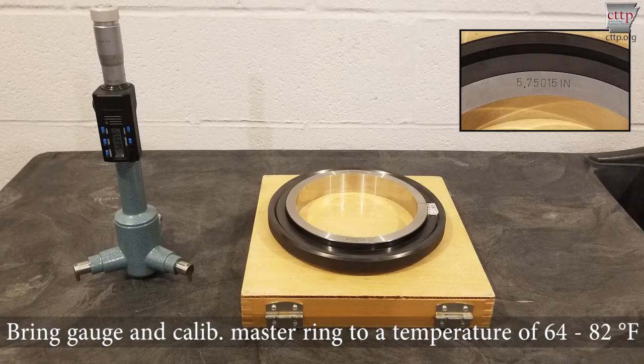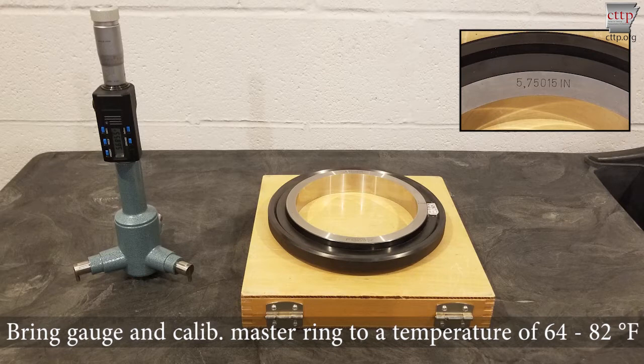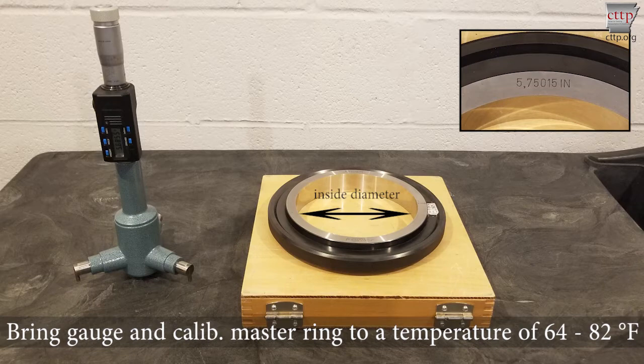To verify the measurement readings of a three-point internal bore gauge, bring the internal bore gauge and calibrated master ring to a temperature of 64 to 82 degrees Fahrenheit.